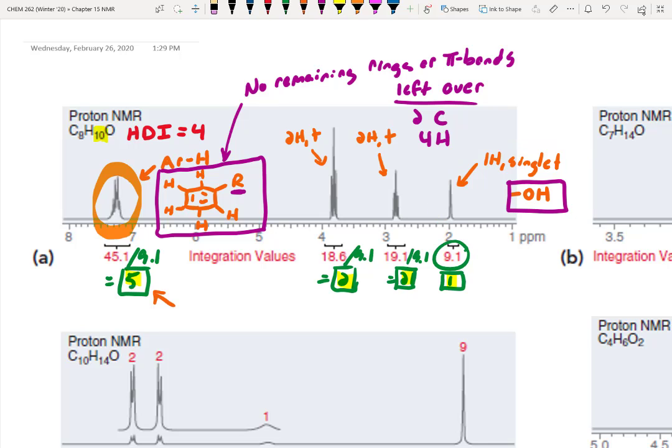So now we've got these leftover triplets in the middle. Both are 2H. We've got 2 carbons, 4 hydrogens. I'll give you another hint too. Over here, we said that this must be kind of a sticky end attached to something. And then over here, in fact, let me draw it in. Over here, this alcohol must be attached to something, right? Can we just attach these 2 pieces together and call it good? No, because then we wouldn't have any place to put these, right? So it's implying that the 2 carbons must be in the middle somehow. What do you think could make sense that could account for those 2 carbons and 4 hydrogens?